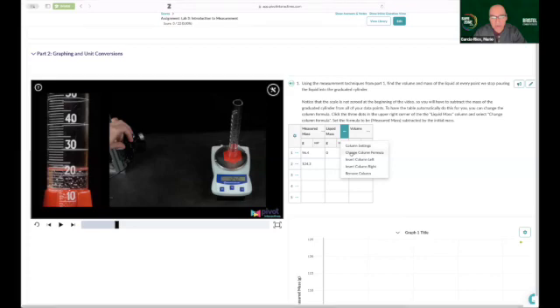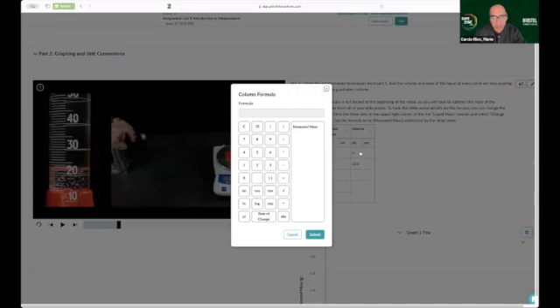You can change the column formula by clicking on that label. This brings up this particular calculator looking thing. If I click on measure mass, the measure mass is going to be put up here under the formula that I want to enter.